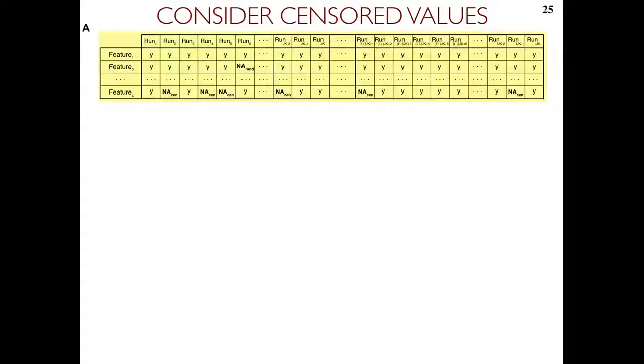So the first thing we do, we will focus on the yellow part, and we will ignore which run comes from which condition. We will only focus on the technology part, and this is where we will replace some of those values by NA censored, right? So NA censored means that it was either missing everywhere except in Skyline, or it was a small value below our vertical line, and we replace the observed values with those NAs. And we write that they're censored because we know they're informatively missing, right? They have their values below the cutoff.